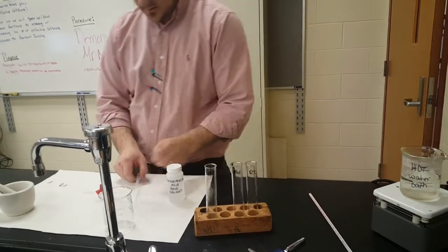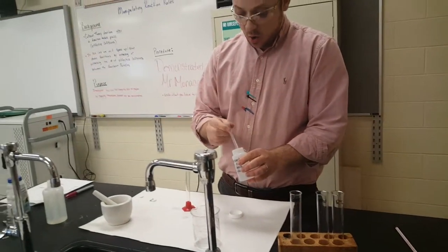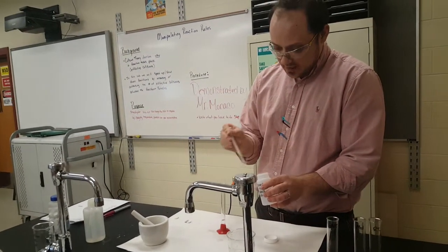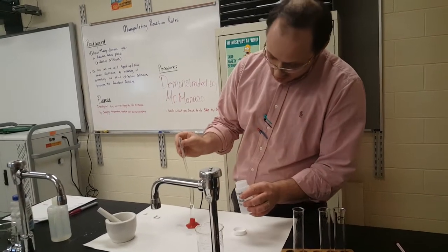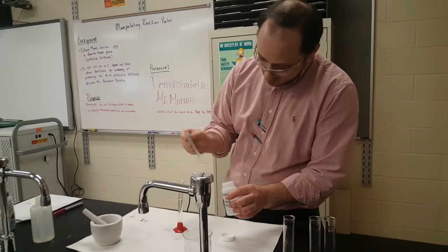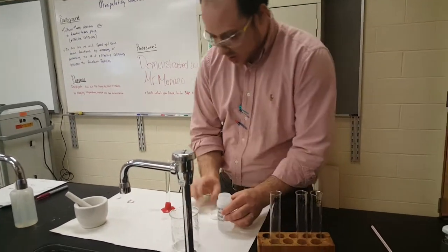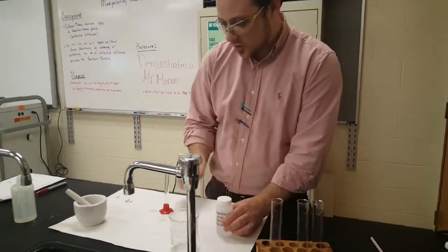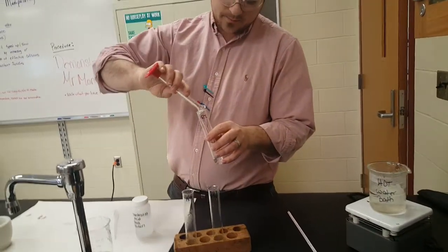So the way you're going to do this, you're going to take 10 mils of acid. The only procedure where you use more than 10 mils is the first procedure. All the other procedures today, you're going to only use 10 mils of acid and be consistent, okay? I'm showing you how to heat up or not heat up your acid.